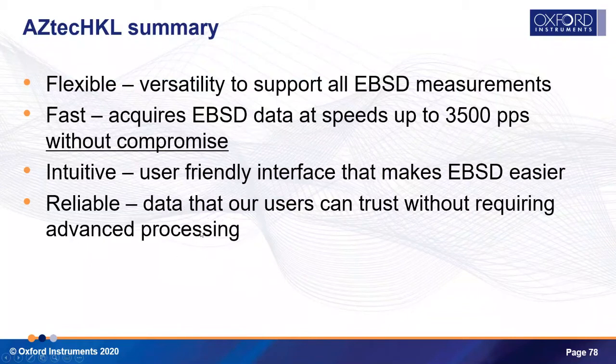And we can take this through to our post-processing without having to clean up the data before we can use it. Generally speaking, the amount of filtering that's applied to data is extremely minimal, if at all.